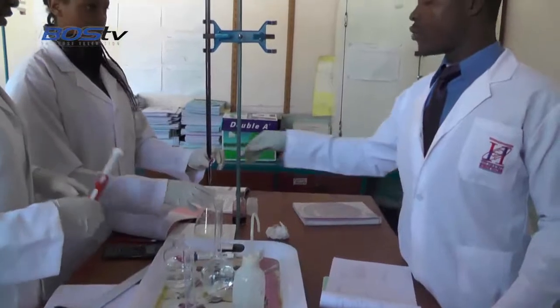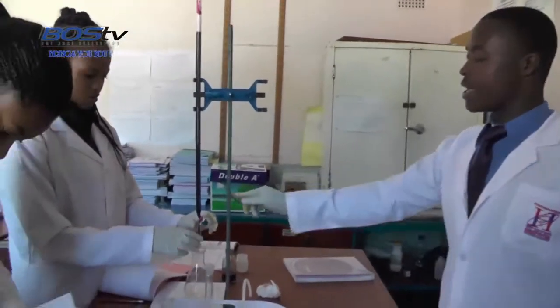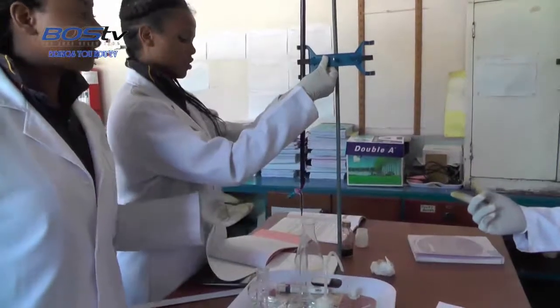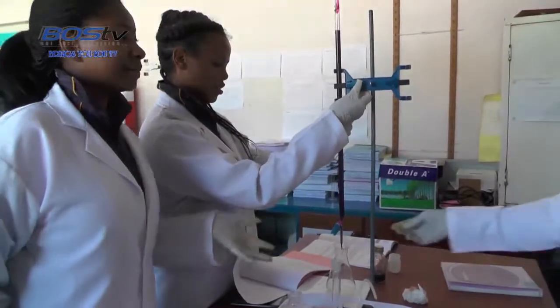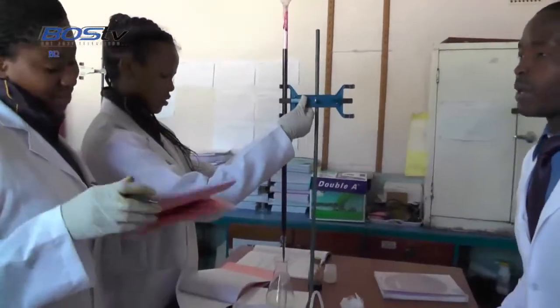Stronger hand for shaking, weaker hand for opening. Your stronger hand should be used to shake and your weaker hand for the tap. You are right-handed? Yes, I'm right-handed. Then your right hand should be used to shake, and your left to open.